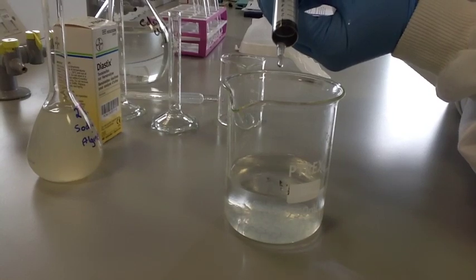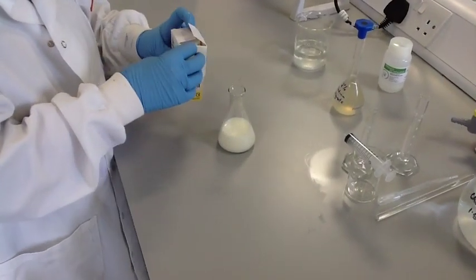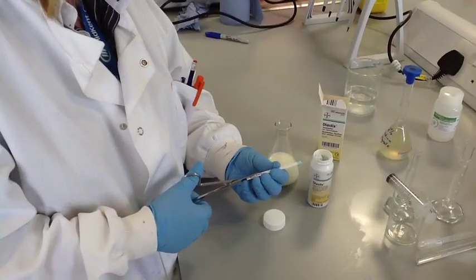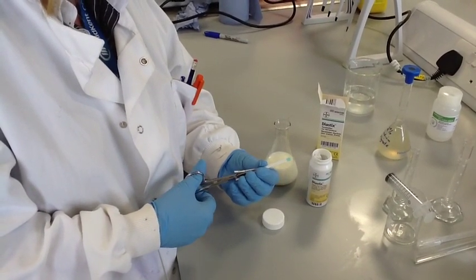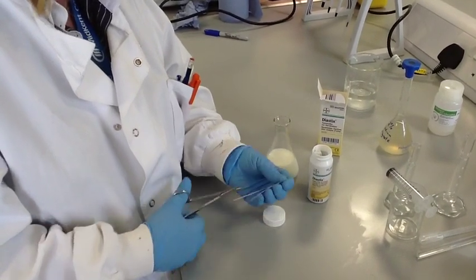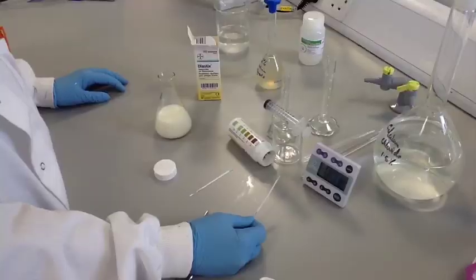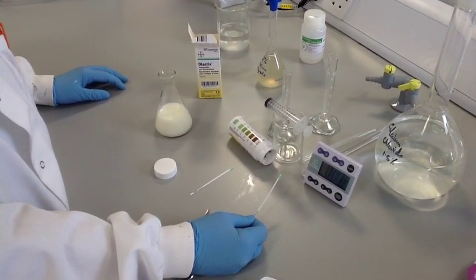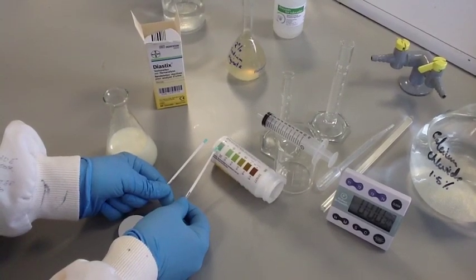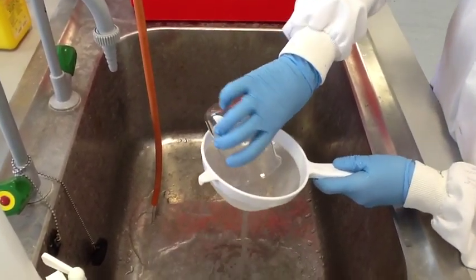Leave the beads in the calcium chloride for a few more minutes to harden. Meanwhile, you can test a sample of milk for glucose using a glucose test strip — you can cut these strips in half to economise. You should find that milk does not contain any glucose. You can now rinse your beads to remove any excess calcium chloride; tap water is fine.